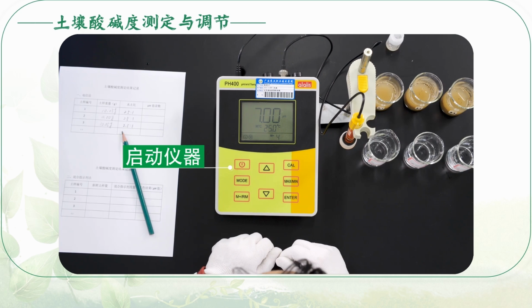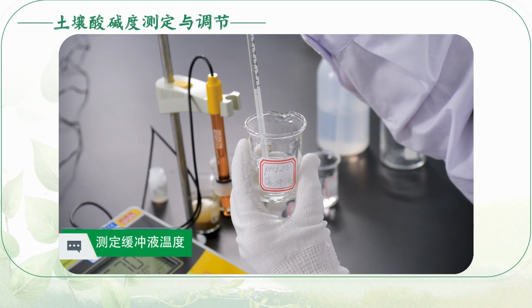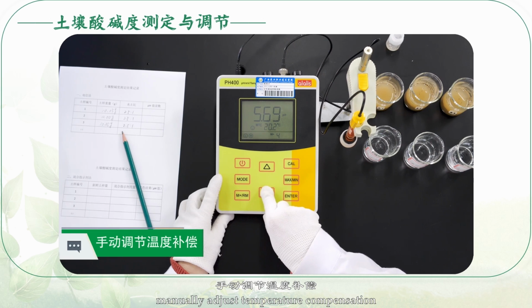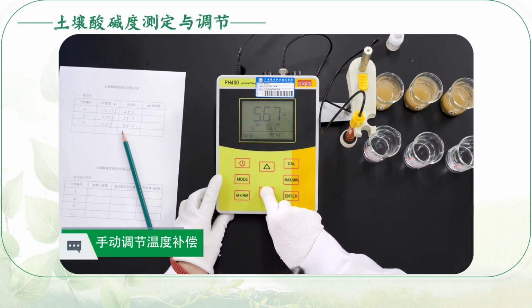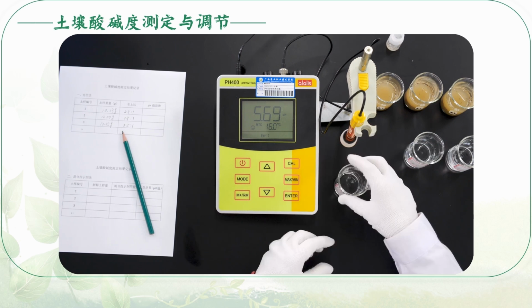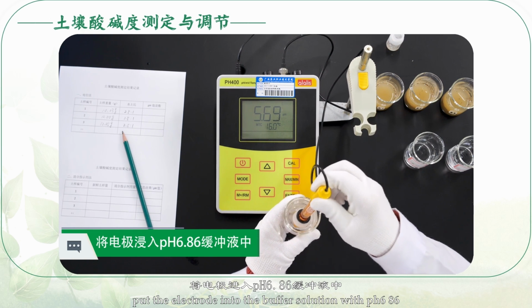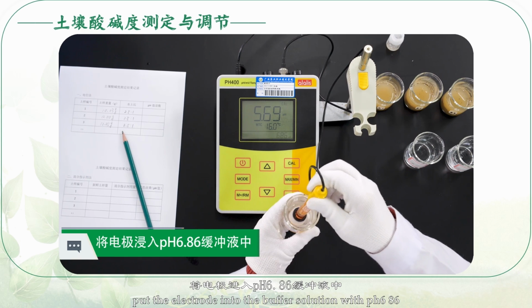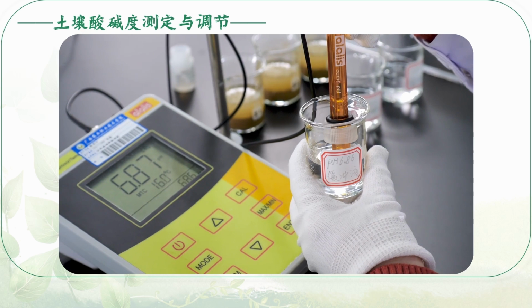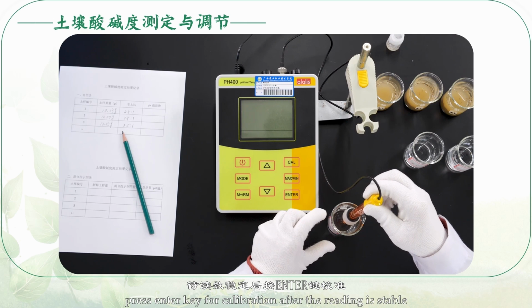Start the instrument. Measure the buffer temperature. Manually adjust temperature compensation. Press the calibration mode. Put the electrode into the buffer solution with pH 6.86. Gently stir and stand still. Press the Enter key for calibration after the reading is stable.